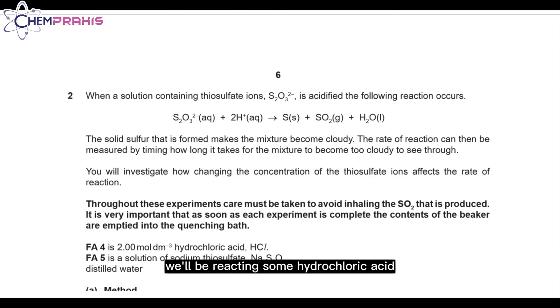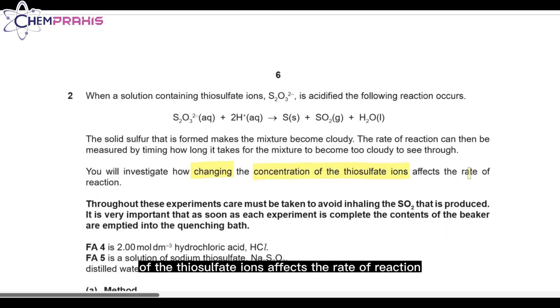In this experiment, we'll be reacting some hydrochloric acid with sodium thiosulfate. We'll investigate how changing the concentration of the thiosulfate ions affects the rate of reaction.